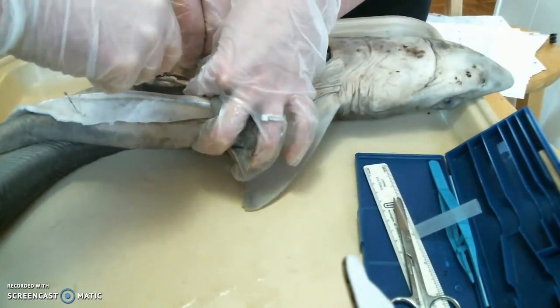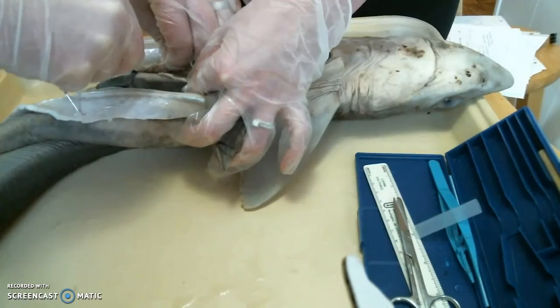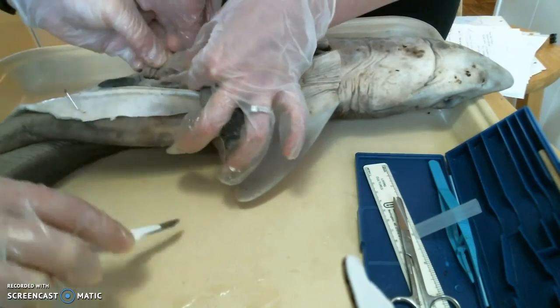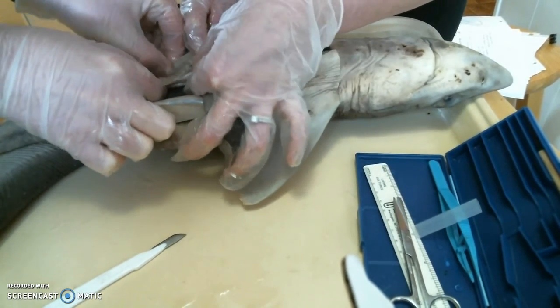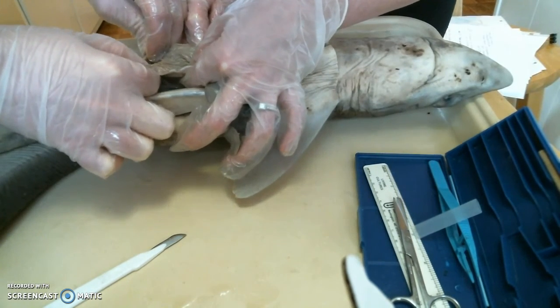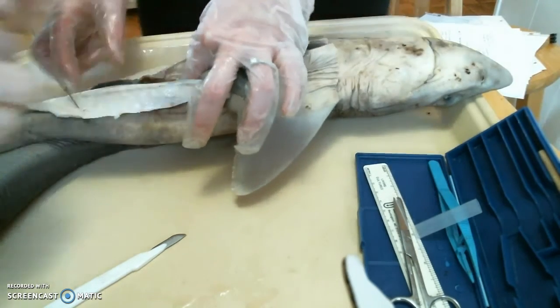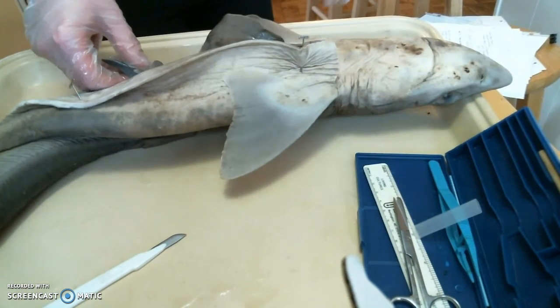Okay, so this is a lot like what I saw in the video before. It's kind of wrinkly and bumpy inside the stomach, but similar to the video I saw, there's not really any evidence of food or anything. It really is just the inside of the stomach. So it's interesting to see the texture, but I don't really see any food at all there. So then I wonder what this is that's connected to, let's see.